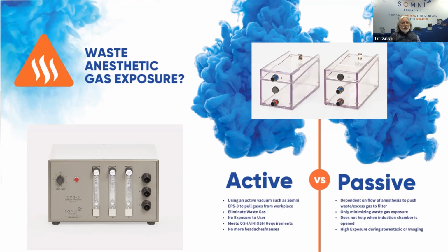What we recommend is an active system. The active system actively draws away the waste anesthetic gas. It's a far more efficient way to contain and control the gases. A good example of this active system is you can see with the induction chambers shown in the photograph there. On the left, we have the active system, on the right, the passive.